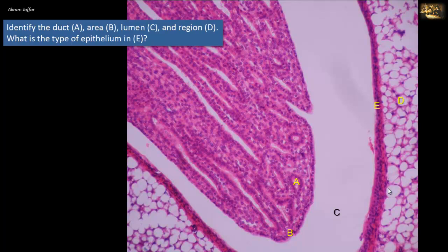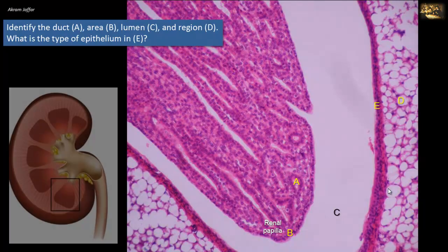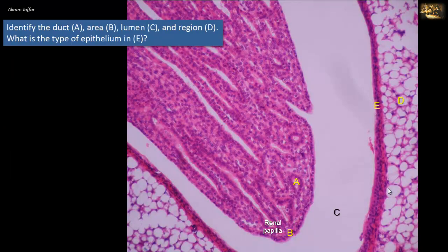Identify duct A, area B, lumen C, and region D. What is the type of epithelium in E? This section shows a renal papilla, represented in B. The renal papilla forms the apex of the medullary pyramid, where the base borders the cortex. The apex projects into the caliceal space shown in C — specifically, C is a minor calyx. The tubular structures marked by A, shown at the apex of the medullary pyramid, are the ducts of Bellini — the largest of the collecting ducts that converge in the renal papilla to discharge urine into the pelvic caliceal space C.